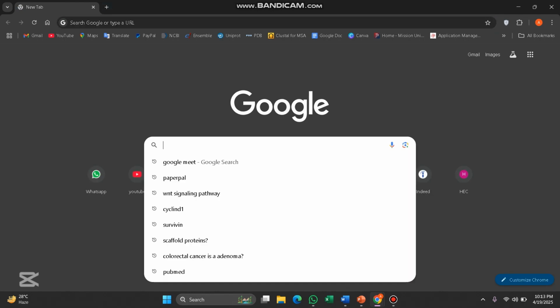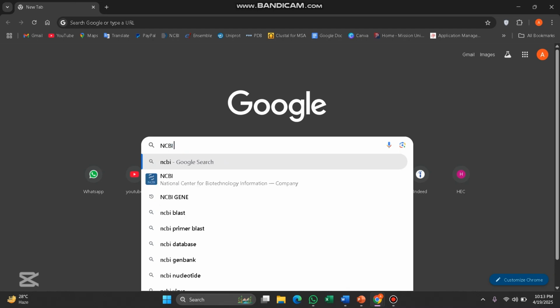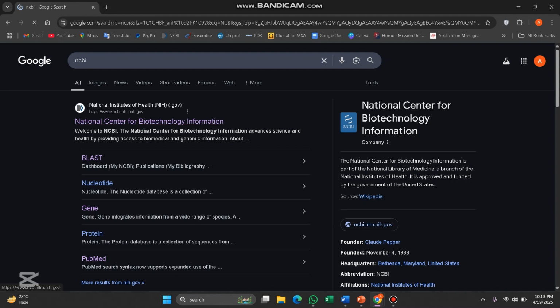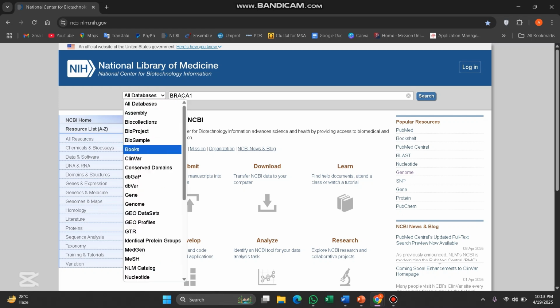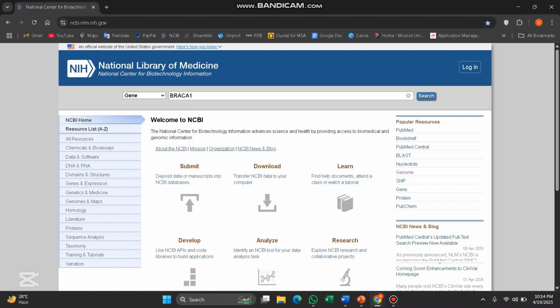Okay, first of all, go to NCBI. Just NCBI. Then click on National Center for Biotechnology, and write a gene name here, like BRCA1, and search in the gene database. Then just click on search.